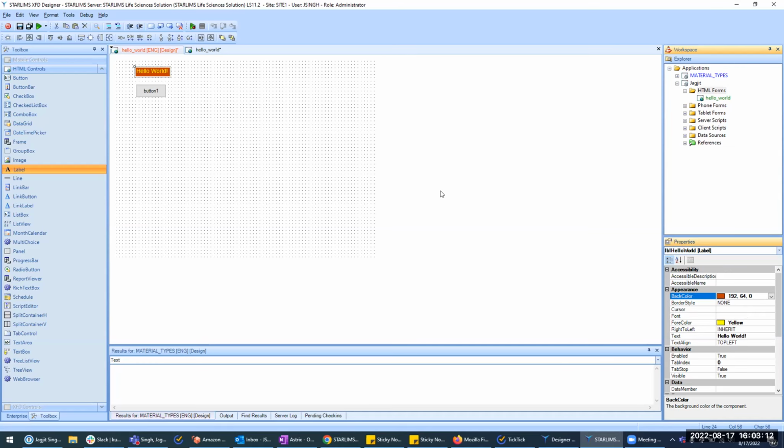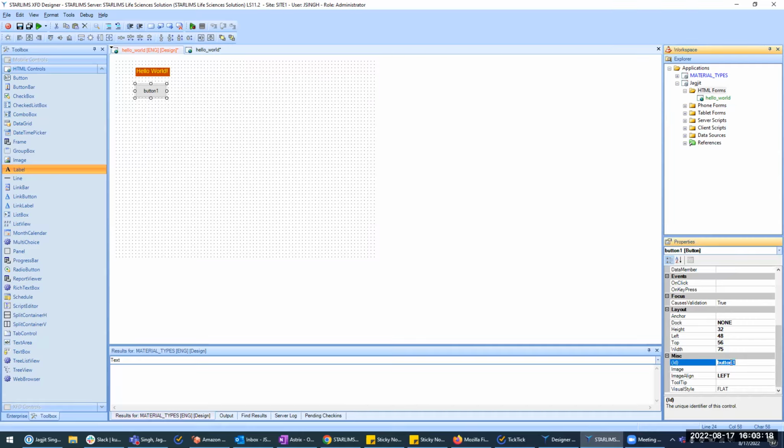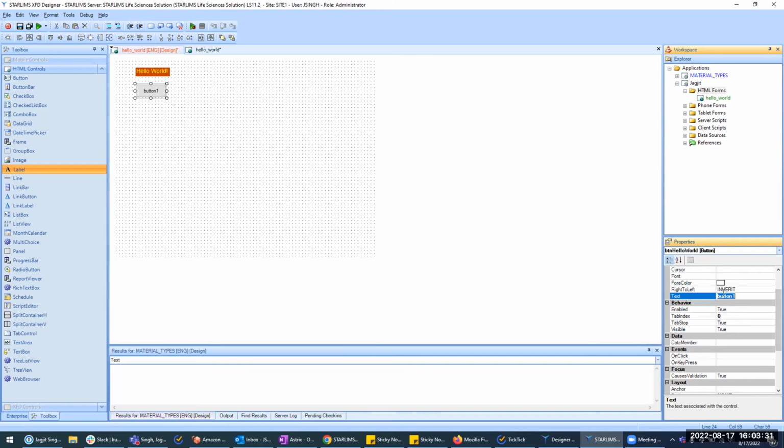Okay, perfect. So for the button, let's do the same 2 properties. Those are the main properties that we're teaching right now. Do you have a naming convention for these? Yeah, BTN for button. Usually it's just an abbreviation of the control. Perfect. And you can call this click here or something.